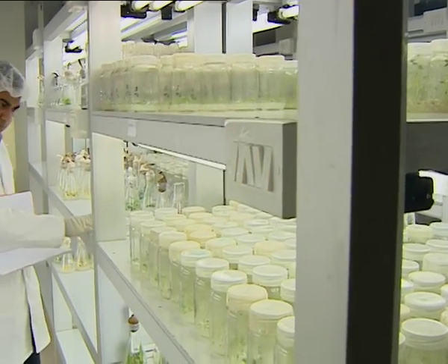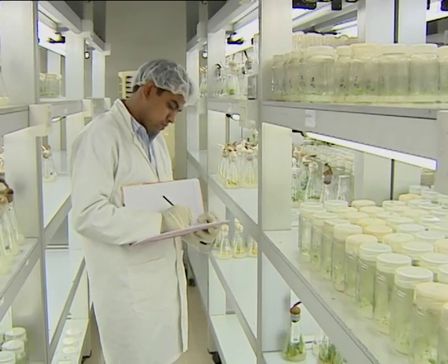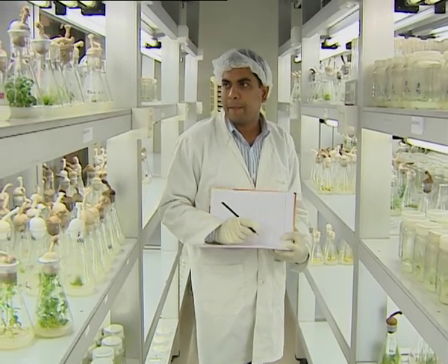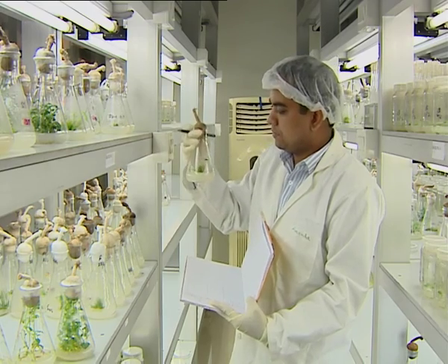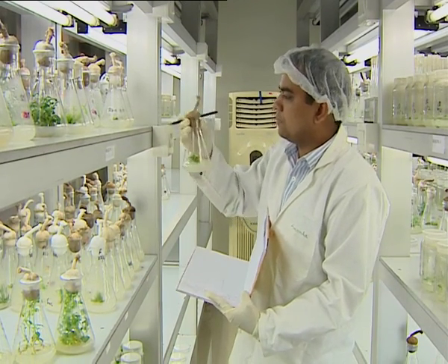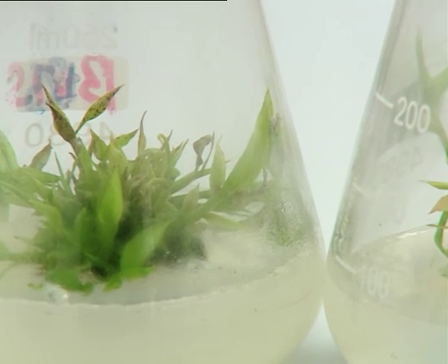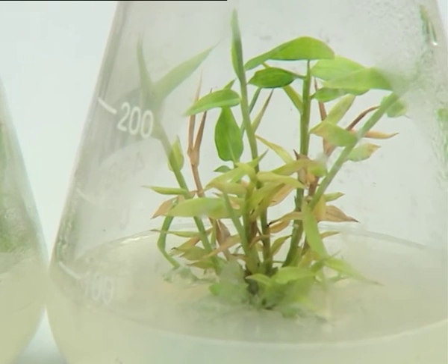After a few days, which may range from 5 to 15 days, all cultures with either bacterial or fungal contaminants are removed and the remaining cultures are allowed to grow further. After a period of time, one ends up with a large number of shoots in a single flask.